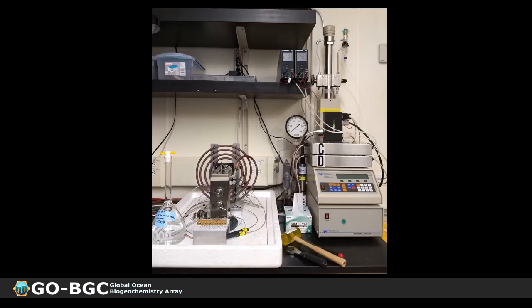And so this is the calibration setup that we use. The pressure chamber is shown on the left, and in this pressure chamber, we can load up to 2 deep sea Durafets, and then we can control the pressure and temperature independently of this chamber. So we can now measure the voltage while the sensor is in 0.01 molar HCl over a wide range of temperature and pressure.